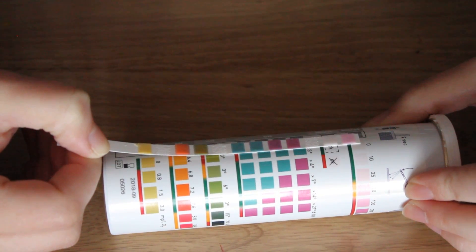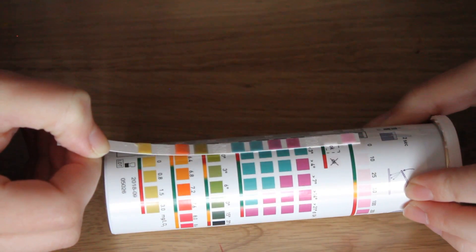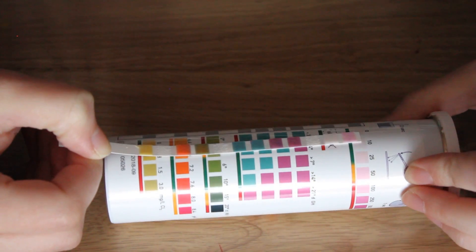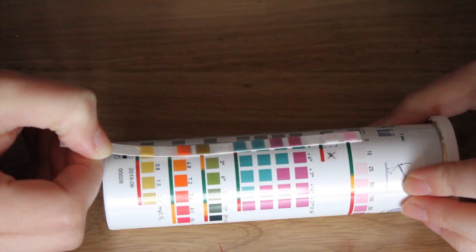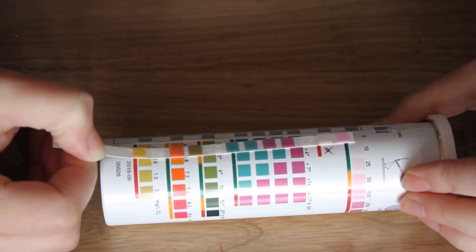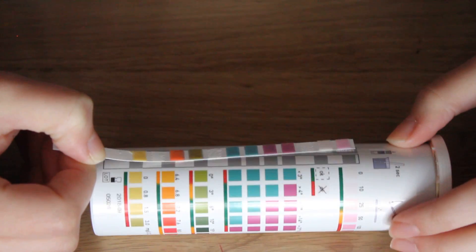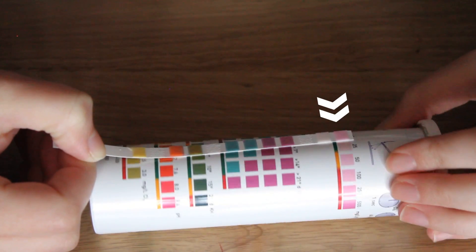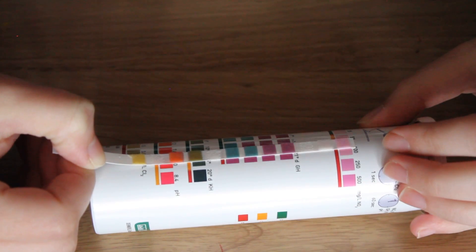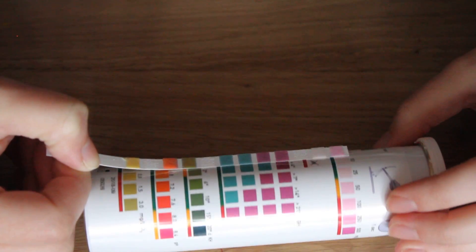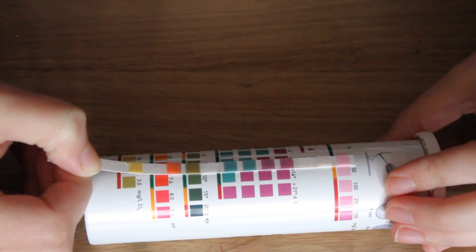Then we have nitrite, which is so difficult. I wish there was more of a difference in color because is it white or is it slightly pink? If it's slightly pink that's not good. As for nitrate this is very high, I would say probably 50 to 100, which is not where you want to be. You want to be somewhere down here but that's okay, that's why we're cycling the tank.